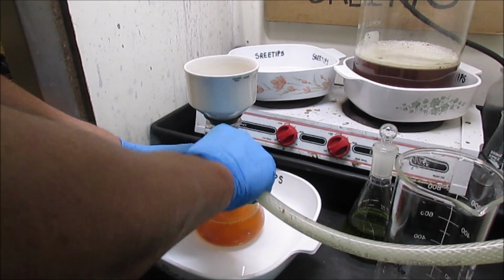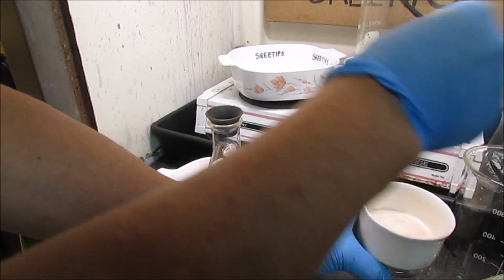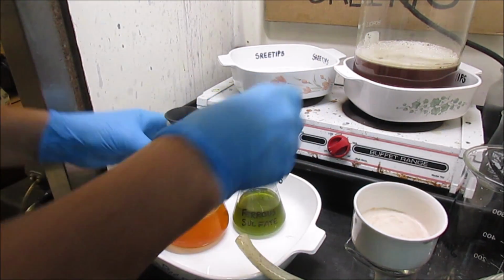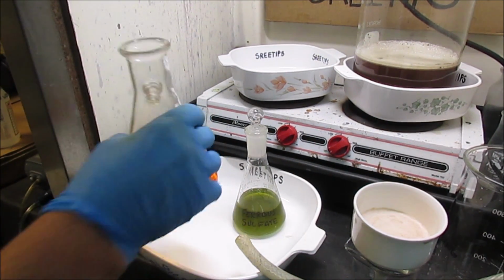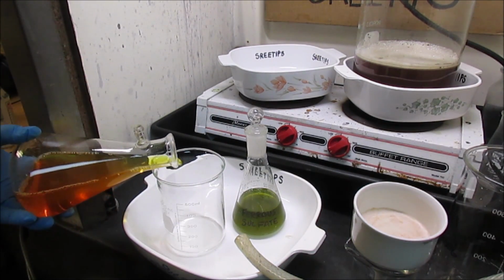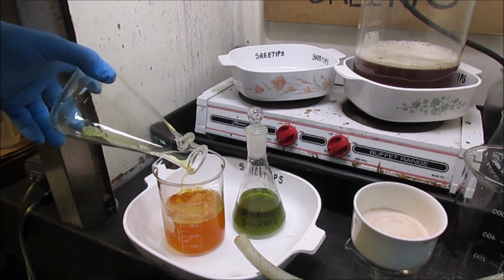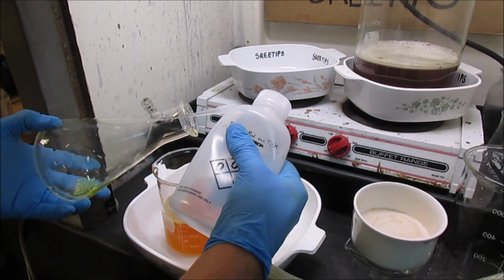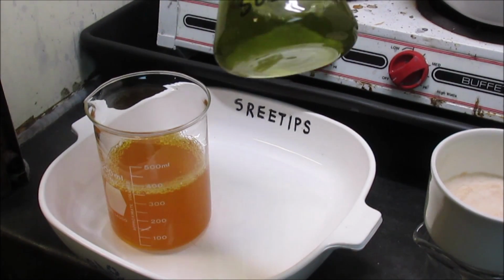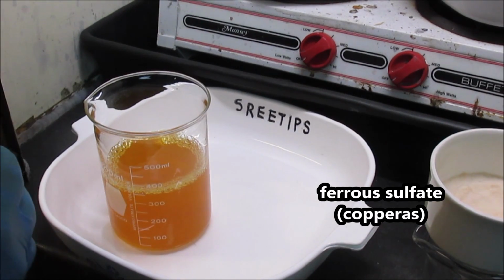Filtering is complete. Now I'm going to drop the gold a second time. I'm going to use some ferrous sulfate here that I dissolved earlier, filtered, and put up just for this purpose. Our concentrated ferrous sulfate solution. It's got some crystals forming on the bottom. I'm going to pour that right in now.